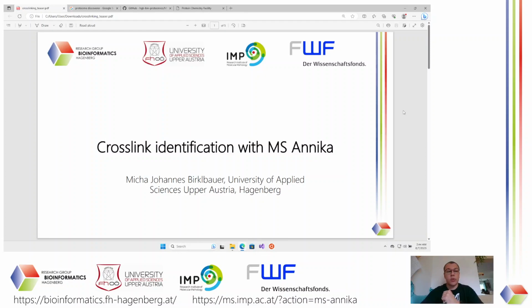And this presentation will also not go over too much cross-linking in general, so it would be advantageous if you already have some knowledge in this field. Otherwise, I can only recommend reading through the MS Annika publications. They give a good introduction to the field, and of course also link to other publications where this is covered more in-depth.